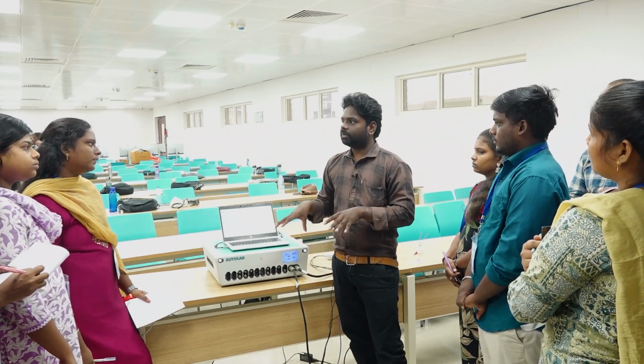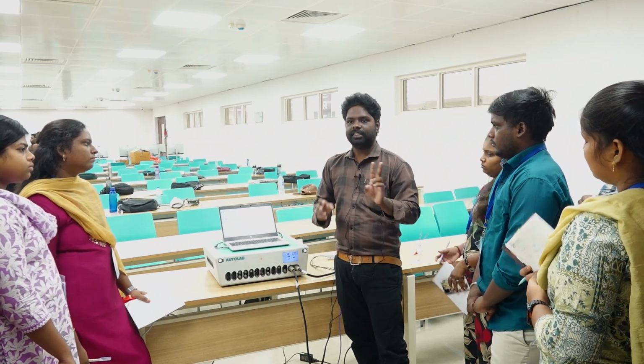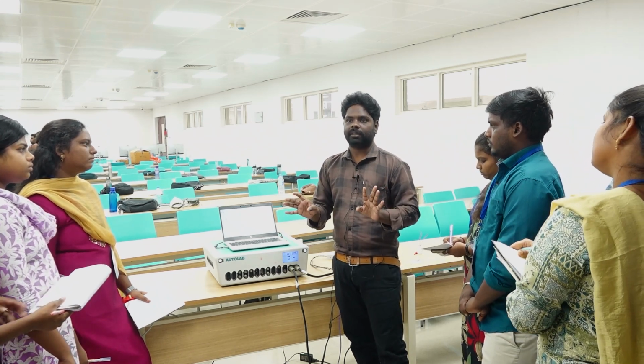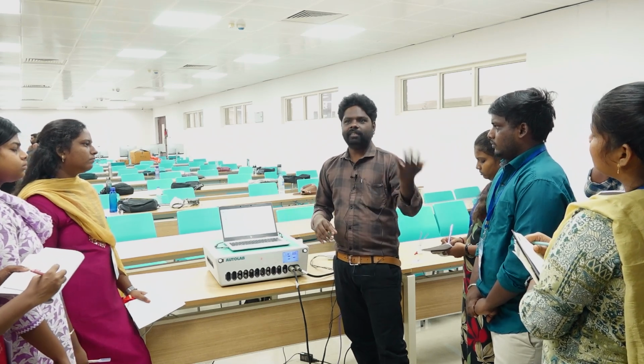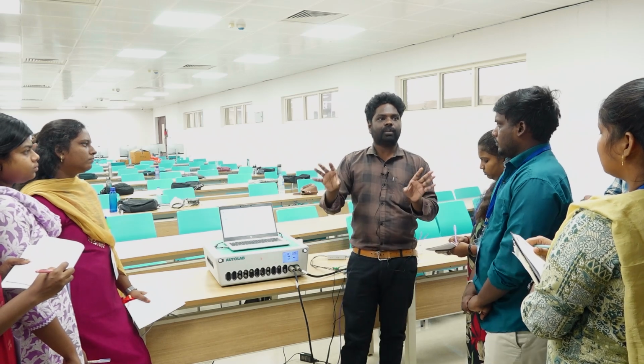When we come into electrochemistry, two techniques are very, very important. Whatever application you are working on, supercapacitors, batteries, energy related devices, corrosion, sensors, OER, HER, even photovoltaic solar research, CV and impedance are very important. These two techniques are the basis for electrochemical studies. For CV, there is one more session covering it. In this one, we are completely talking about EIS.